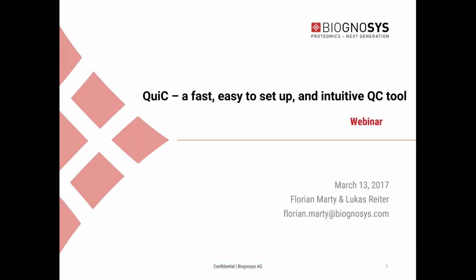Welcome to today's webinar featuring our latest software release called QuiC, a QC analysis tool that is fast, easy to set up, and produces intuitive readouts for your quality control measurements of your LC-MS setup.